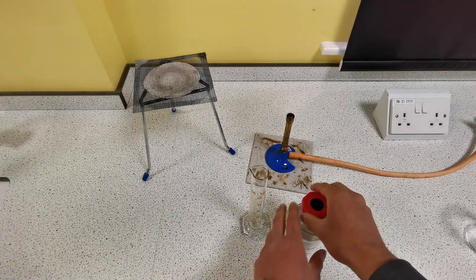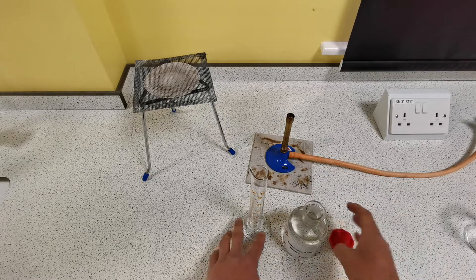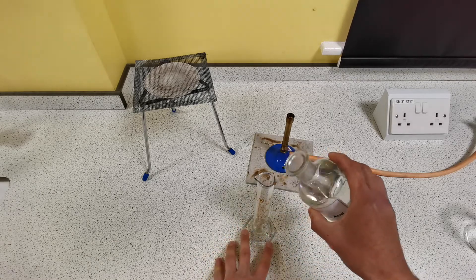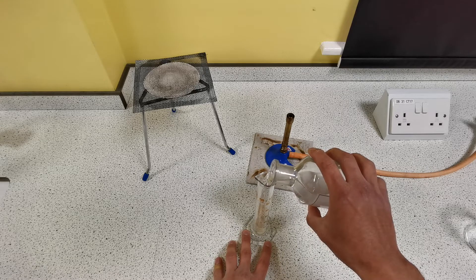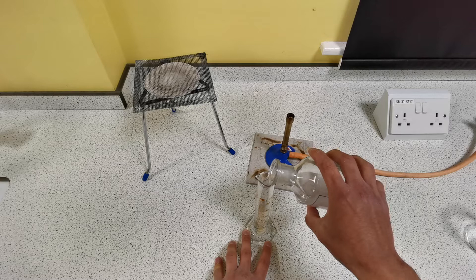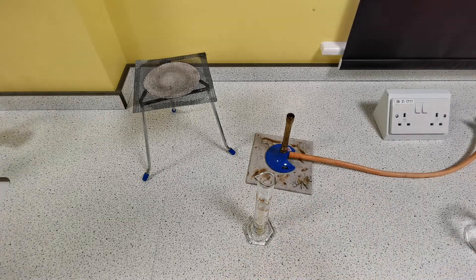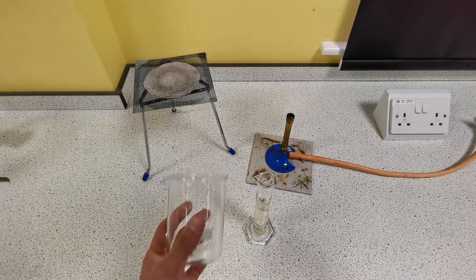We're going to start by measuring 40 centimetres cubed of sulfuric acid using the measuring cylinder, and we are going to pour this into the 250 millilitre beaker.